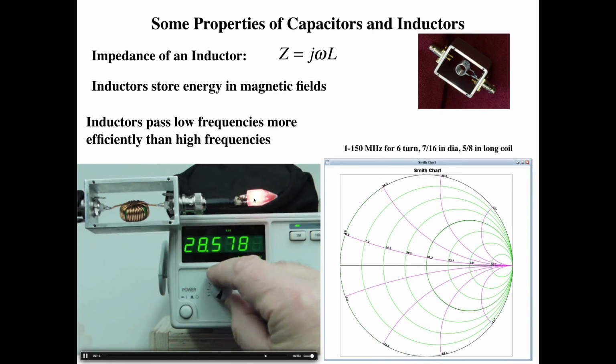That had just the opposite behavior of the capacitor. So it was passing current at low frequency and not so well at high frequency.